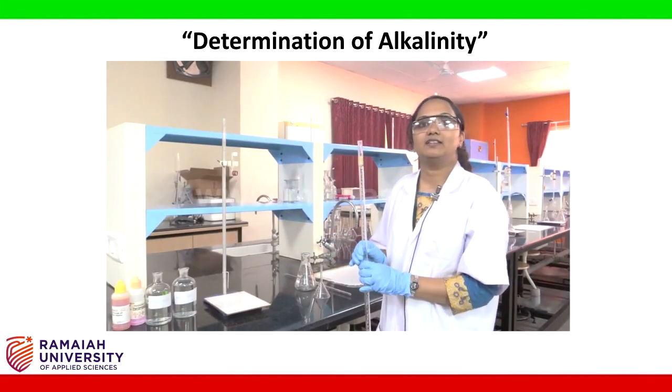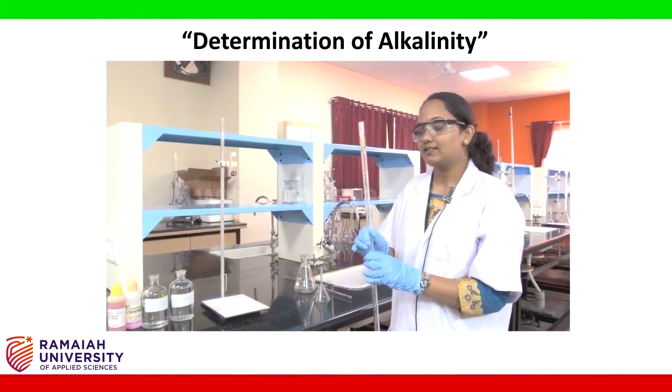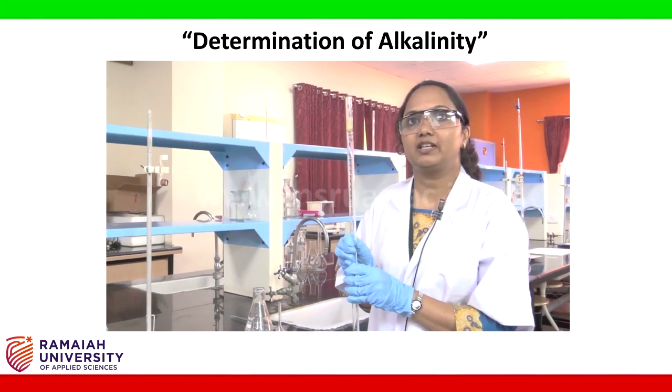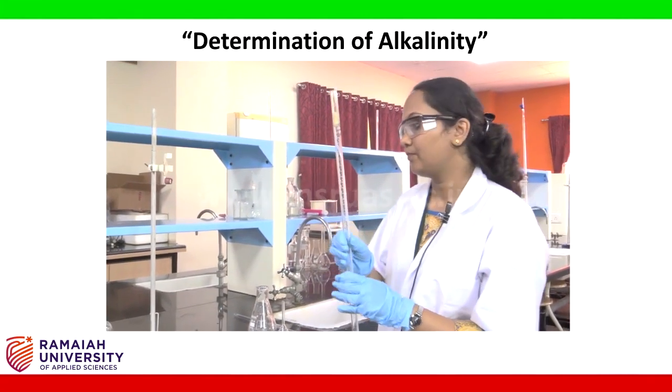After rinsing all the apparatus, we need to rinse the burette with sulfuric acid, because we are going to take the sulfuric acid in the burette.